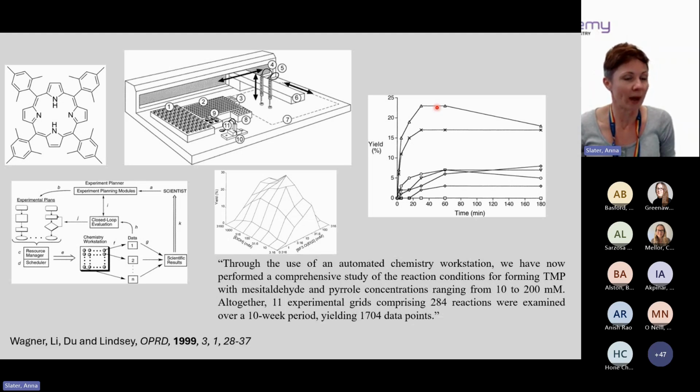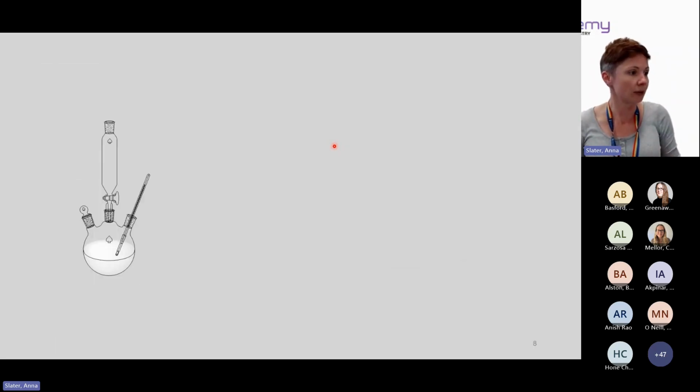And I think that's where flow chemistry for me has really helped in this situation. Because there's only so much you can do on this platform in terms of this chemistry. What you might need is a completely different approach. So if a reaction works in batch, you should do it in batch. I would be the first to say that.